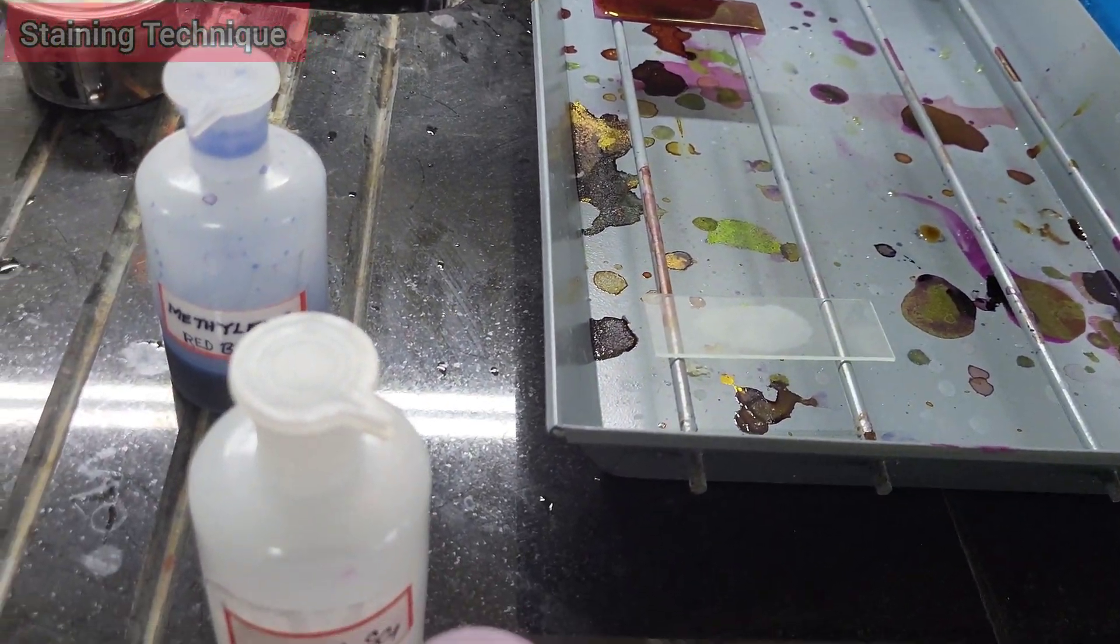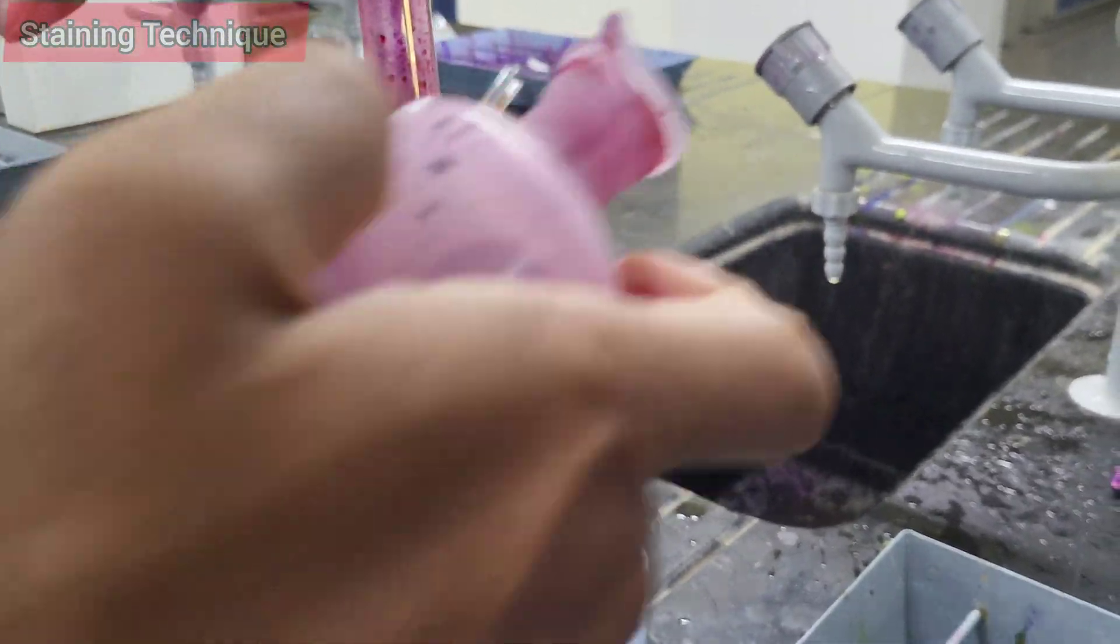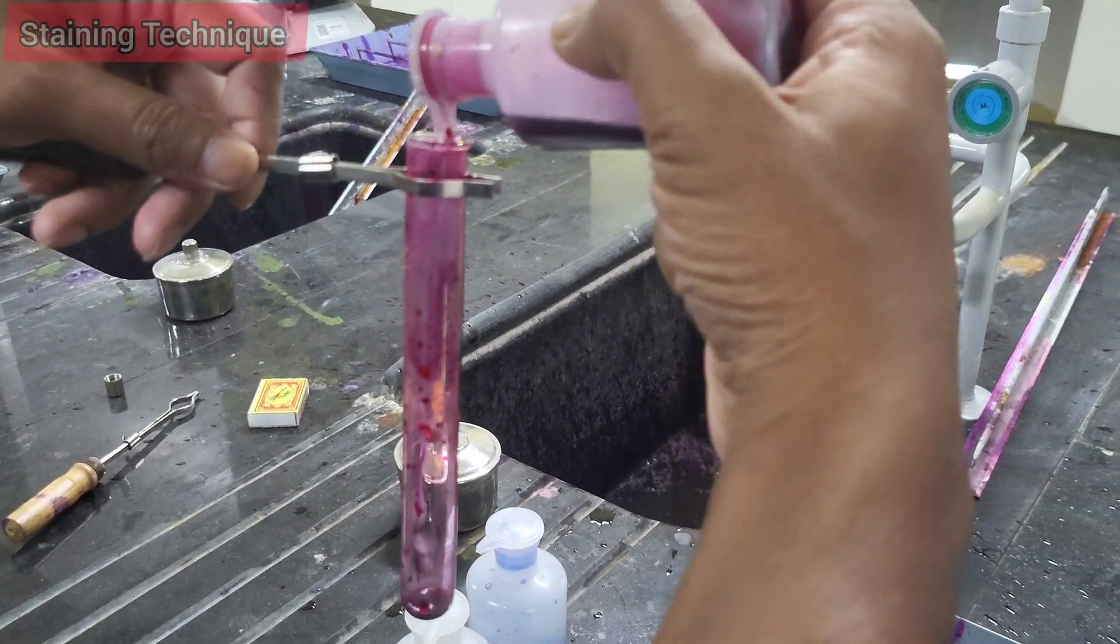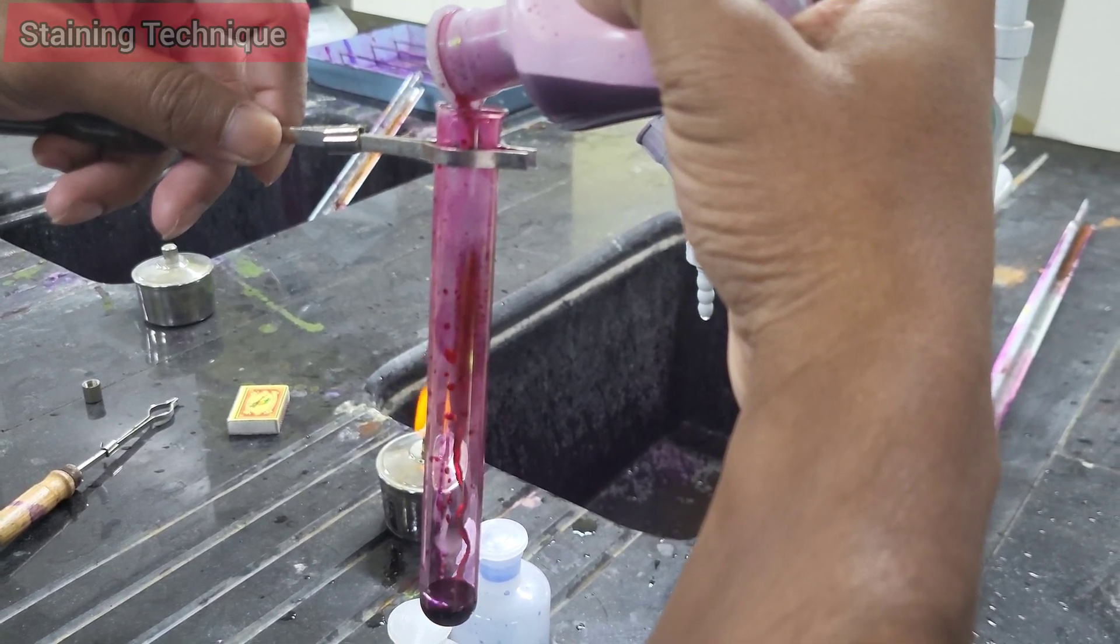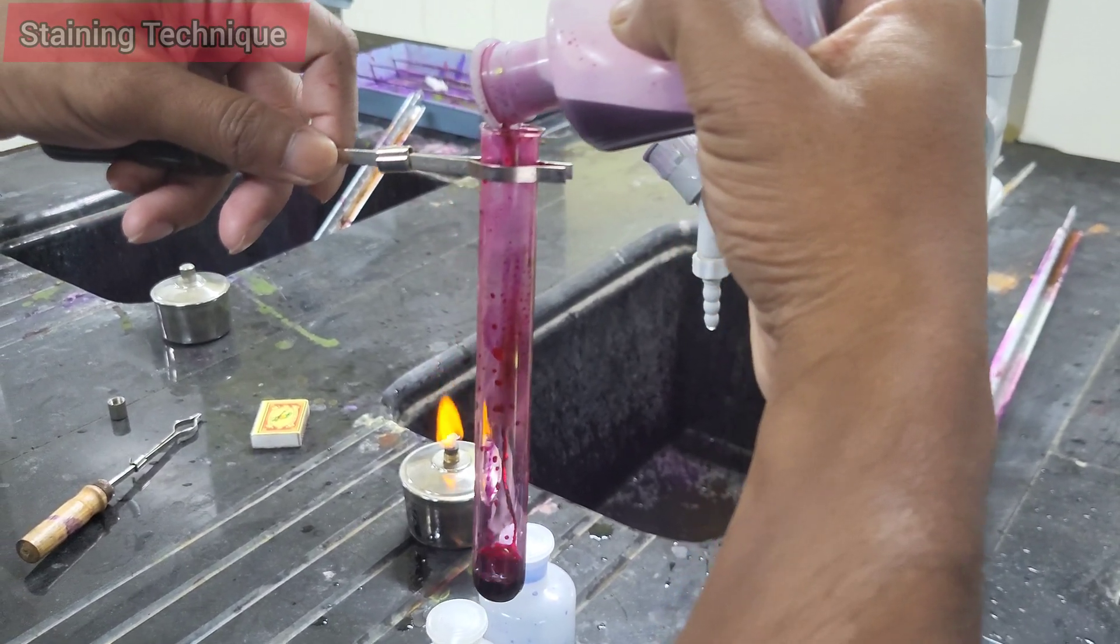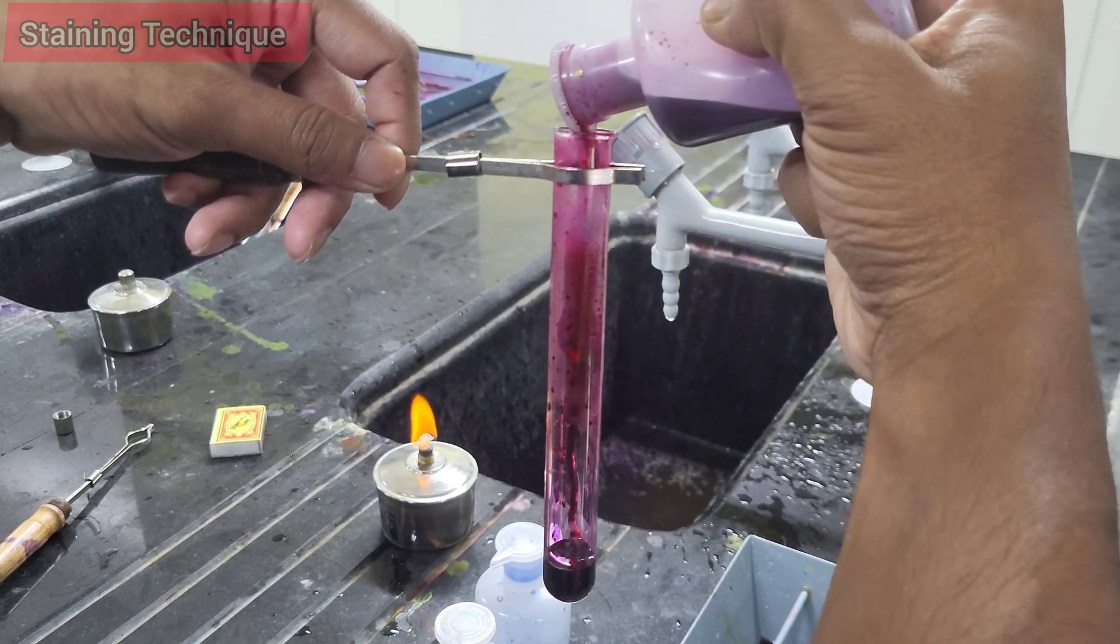Or you can heat the carbolfuchsin in test tube and pour it over the slide and wait for five minutes. Why carbolfuchsin used in Ziehl staining? It's a phenolic dye that penetrates the waxy cell wall. Why heat is applied during staining process? Heat enhances the penetration of carbolfuchsin in the waxy cell wall of acid-fast organisms.